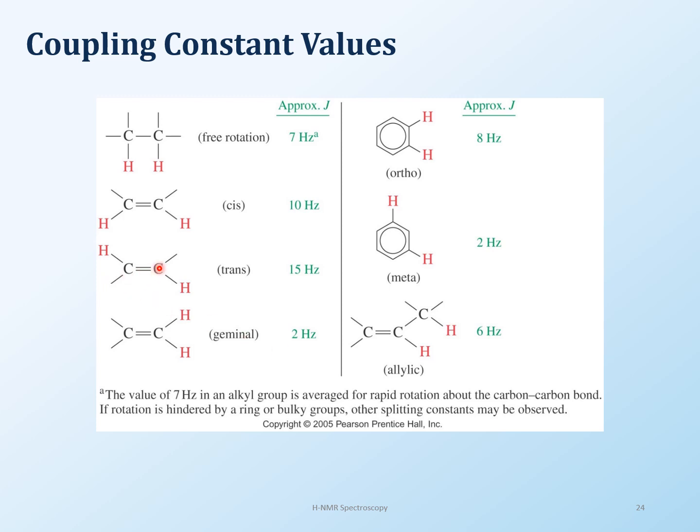Now remember, these two carbons are next to each other, but these protons are not alike, right? These two protons may have a different environment. These two protons will have a different environment. These two have a different environment. So they're all going to show you different signals. And so it becomes a little bit more complicated with double bonds.